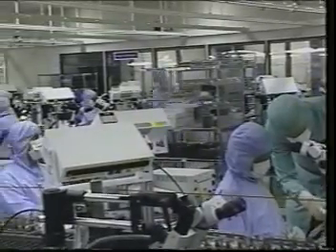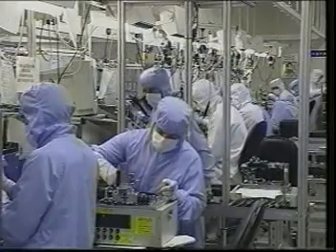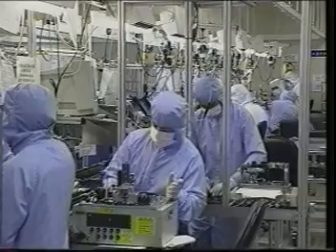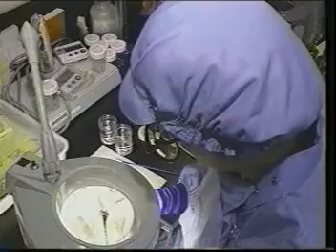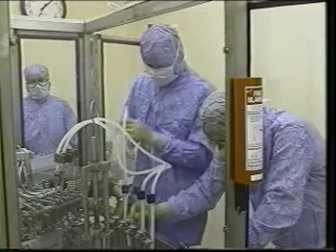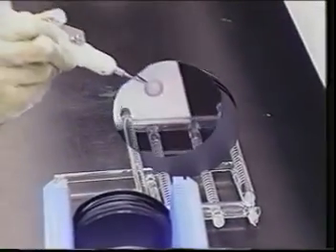Today, many of our workplaces require strict clean room environments within which we take the responsibility for producing semiconductor devices, disk drives, biotech products, pharmaceuticals, and the like. In these critical areas, the consequences of contamination are very real and often quite costly. Take the semiconductor industry, for example.